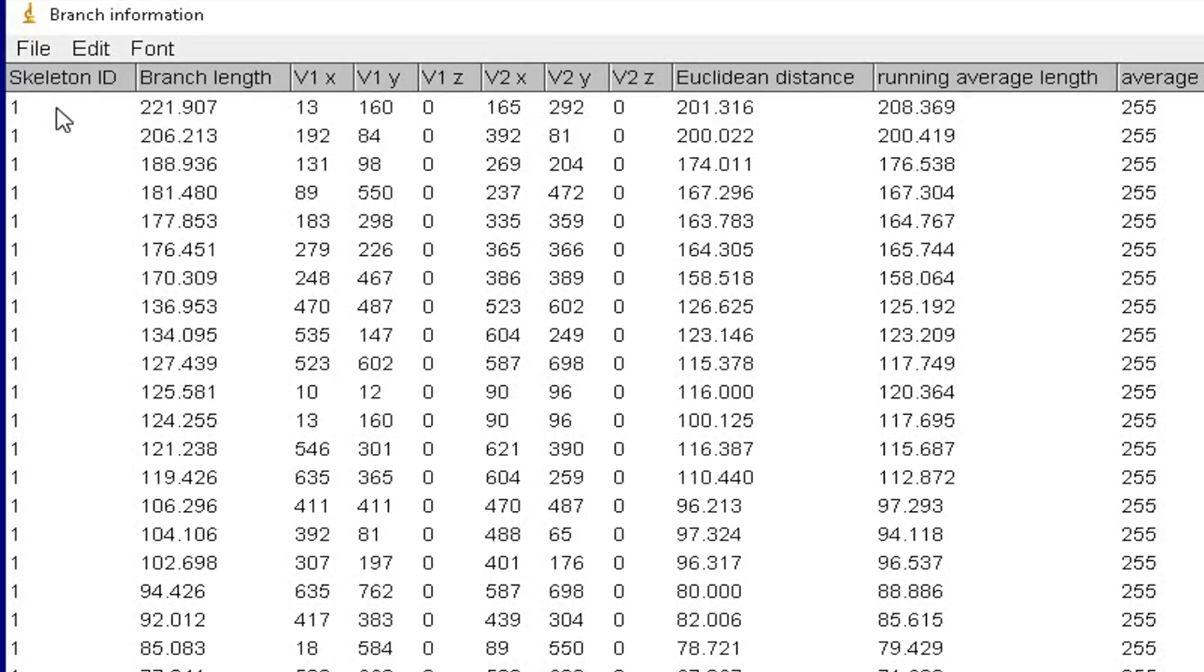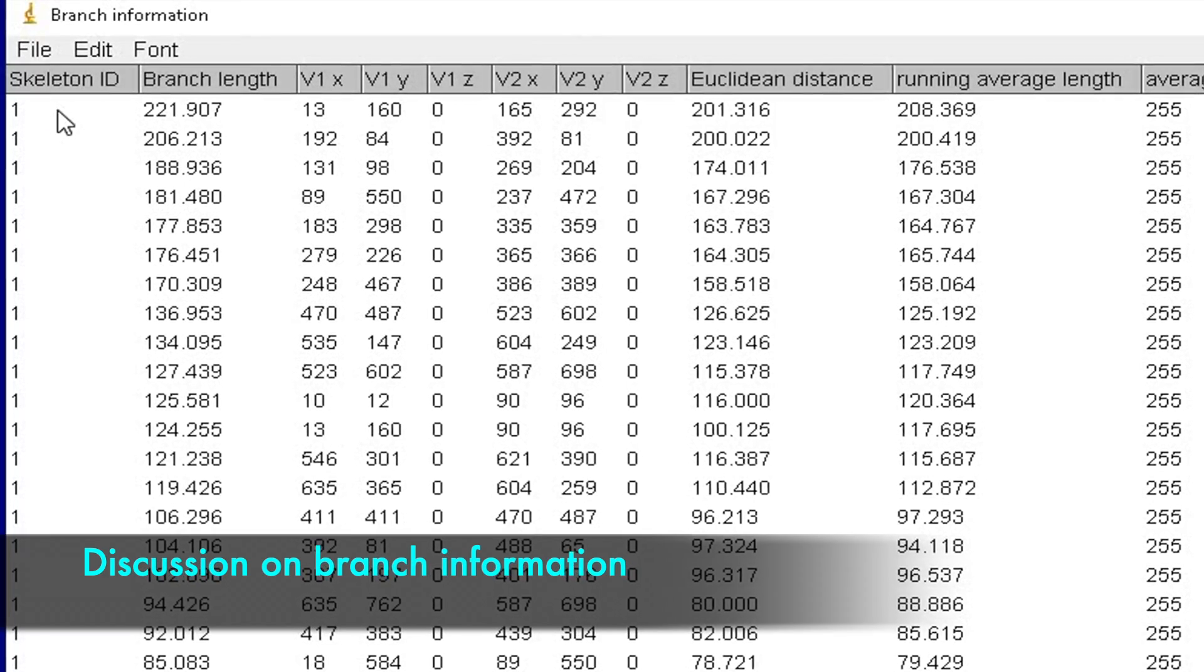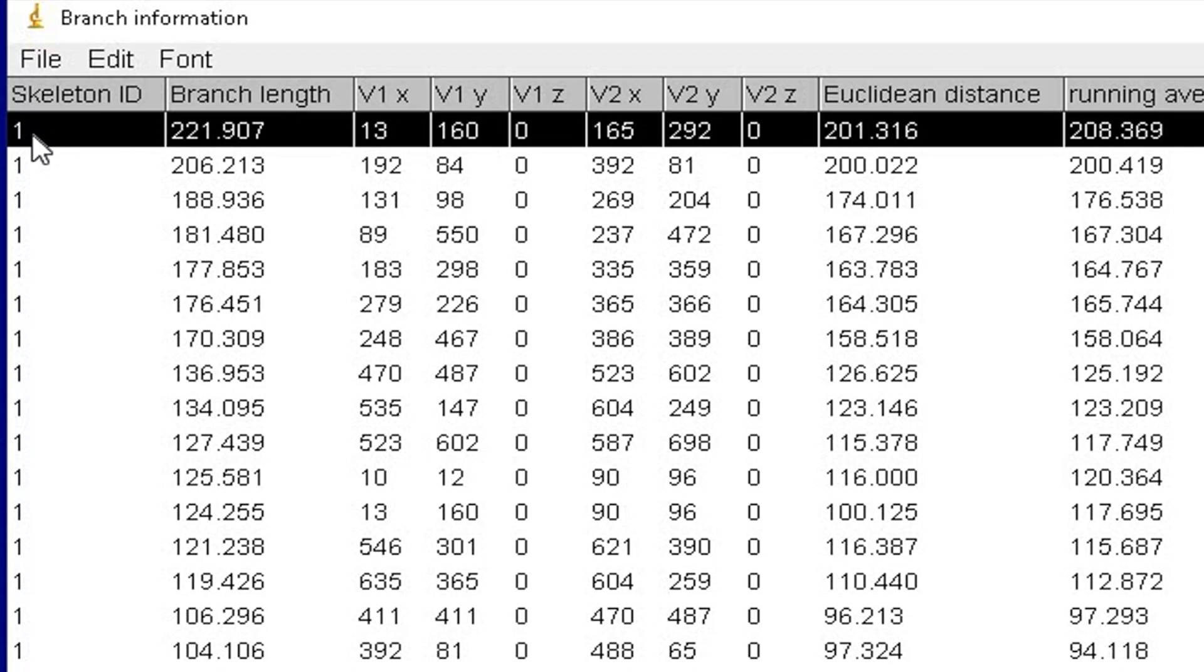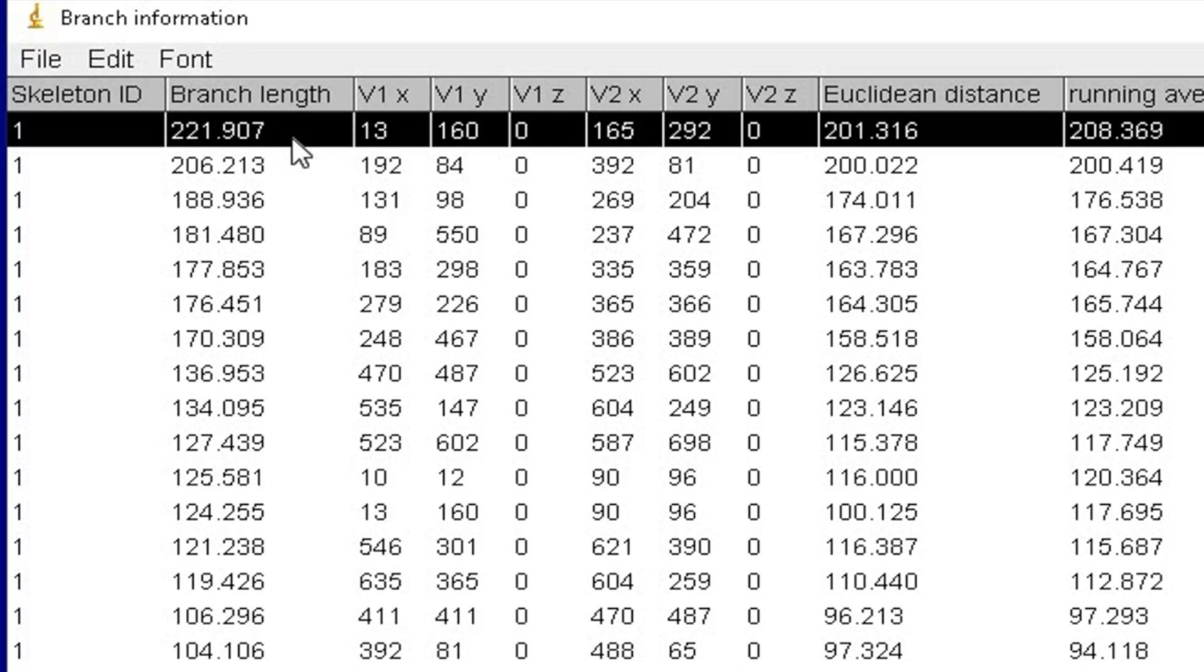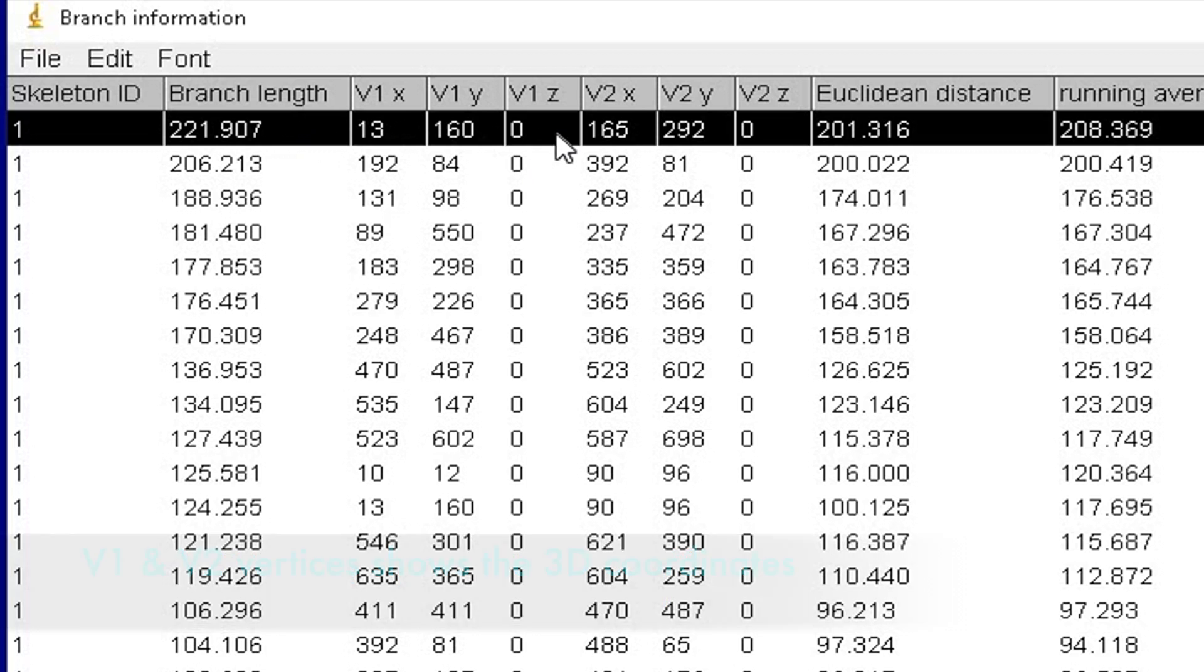The result window displays a skeleton ID for each branch and provides the branch length arranged by decreasing length of the branches. V1 and V2 vertices show the 3D coordinates of the extremes of the branch.